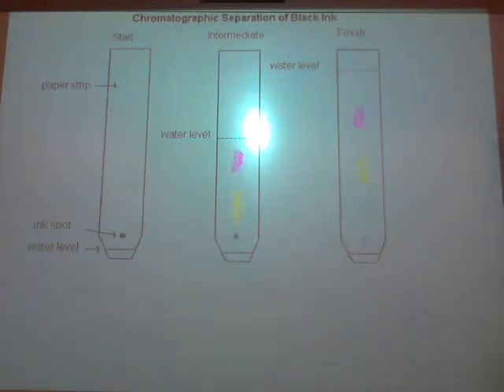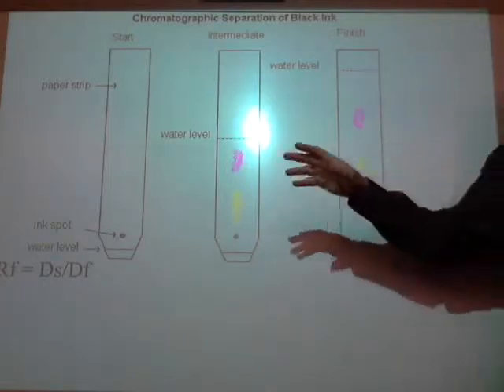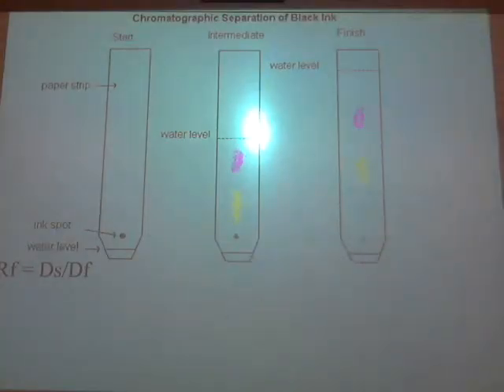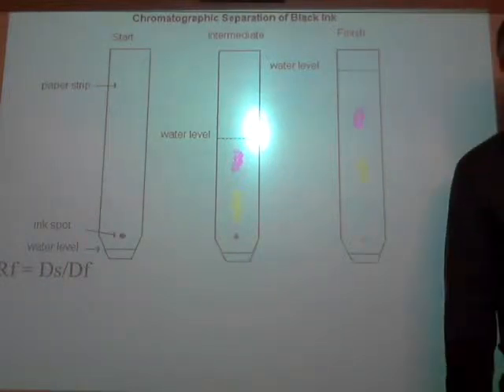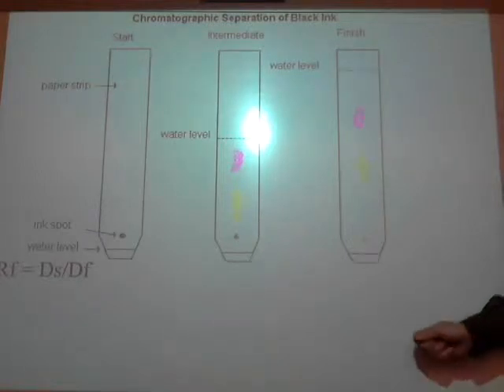I can calculate based on how far this guy moved versus how far the water moved, what's called the RF value. You have to write this down at the bottom, RF value. The RF value is just Ds over Df, where Ds stands for the distance traveled by the substance, the color, and Df stands for the distance traveled by the solvent front.